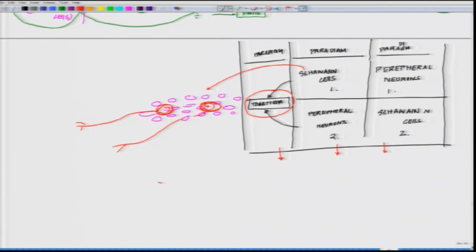Now, here is the interesting part. If you look at the neurons when they are forming a myelination, this is the classic part of what you will be observing. These are the dendrites, and assume that this is where you are seeing the myelination.